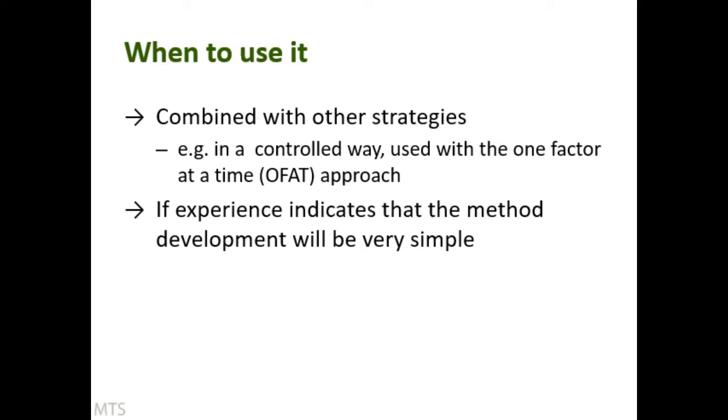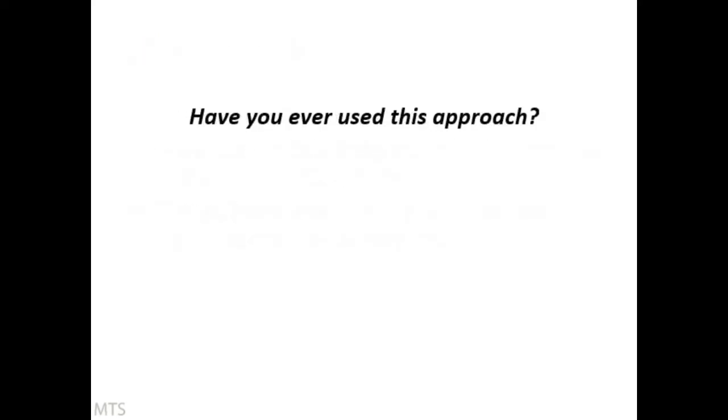And again, we've just got trial and error. Is that something that you've had a go at in any context? And yeah, we've got a lot of yeses. So this is something that we do. We're curious as analysts, aren't we? We just say, what does this button do? So we just try something, see what happens. And sometimes this is a really good learning technique. So in the point of view of, yes, you want to develop this method, that's your primary objective.